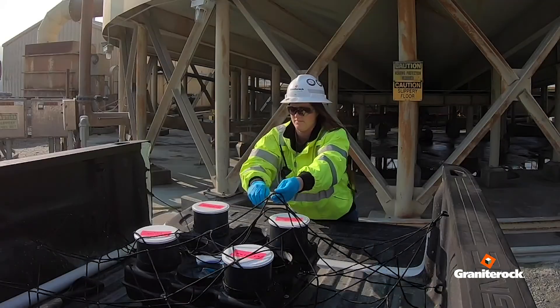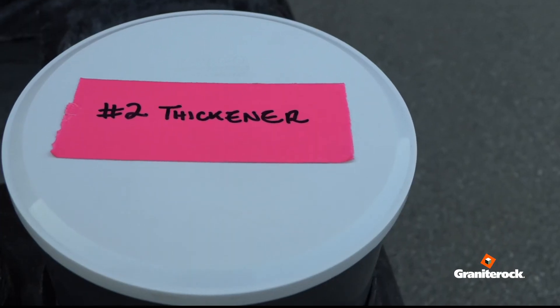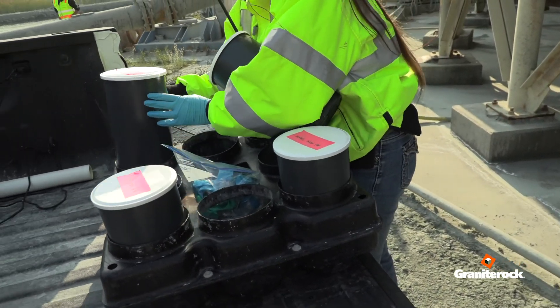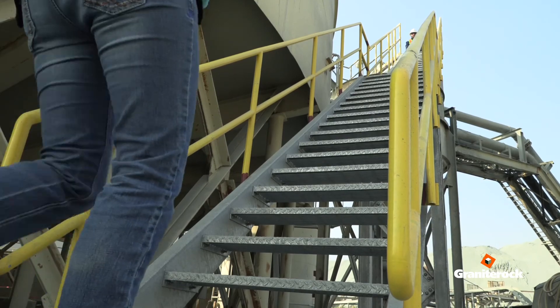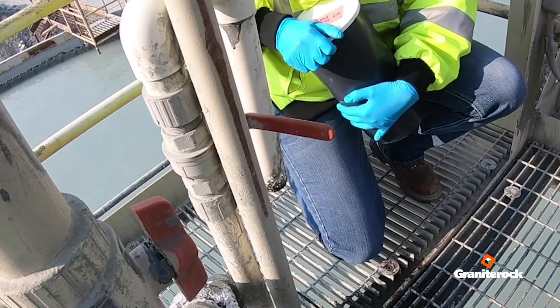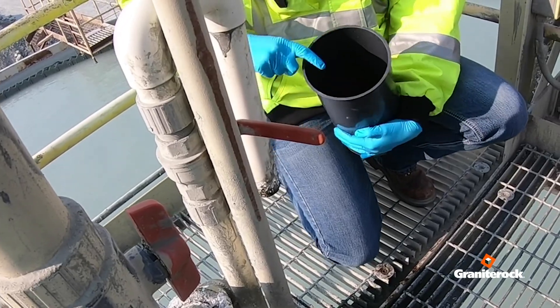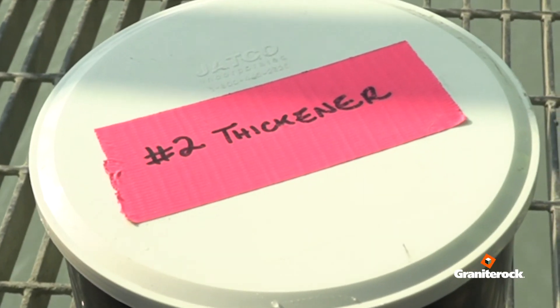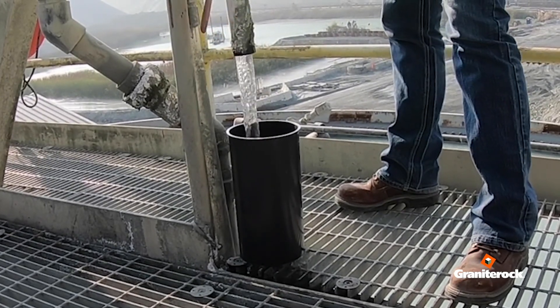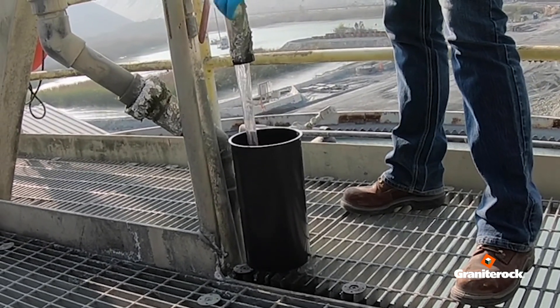Sample number two: with both containers labeled number two thickener and number three thickener feed, climb up to the thickener tank catwalk using three points of contact at the stairs. Diluted polymer can be sampled from a valve above the tank. Place the container labeled number two thickener under the pipe and pull the valve to collect half a container of diluted polymer.